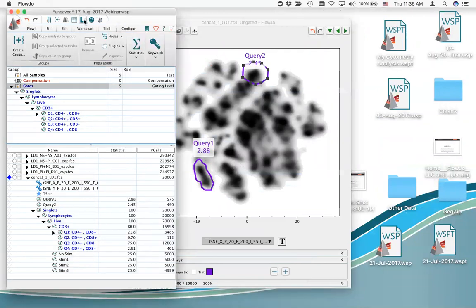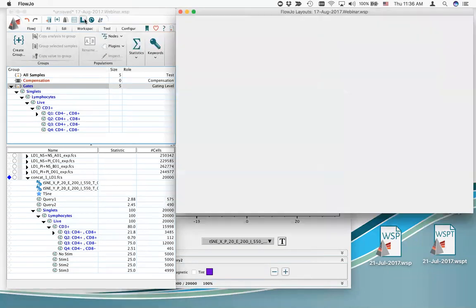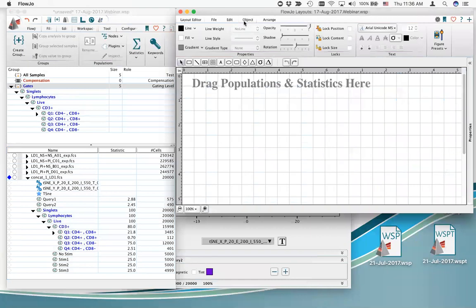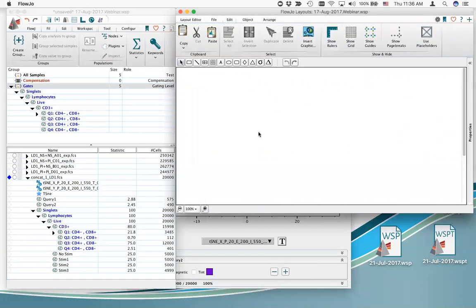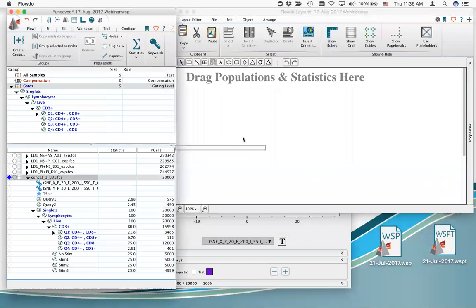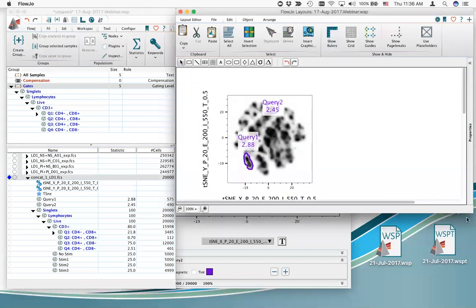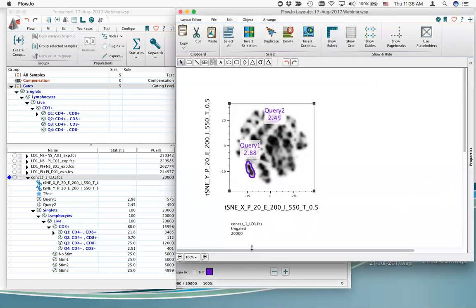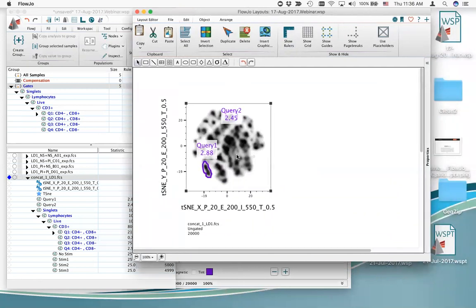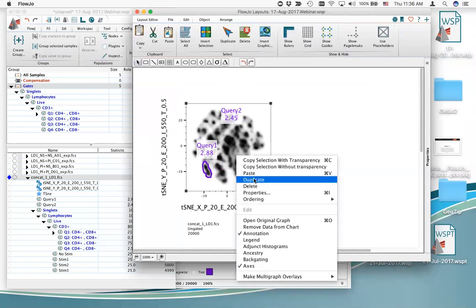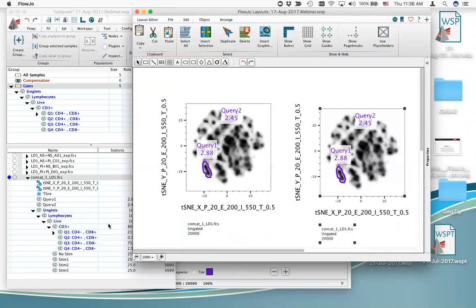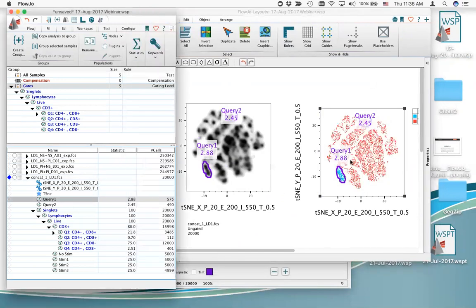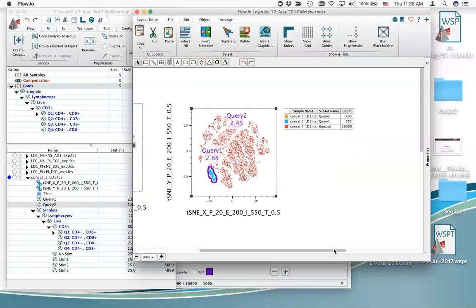Open the layout editor using the L button in the static toolbar. It opens a new layout. Drag in the root population, which shows the two t-SNE parameters with gates. You can duplicate the plot, move it over, and drop query nodes on top. As you drag and drop onto the same dot plot, you get an overlay.